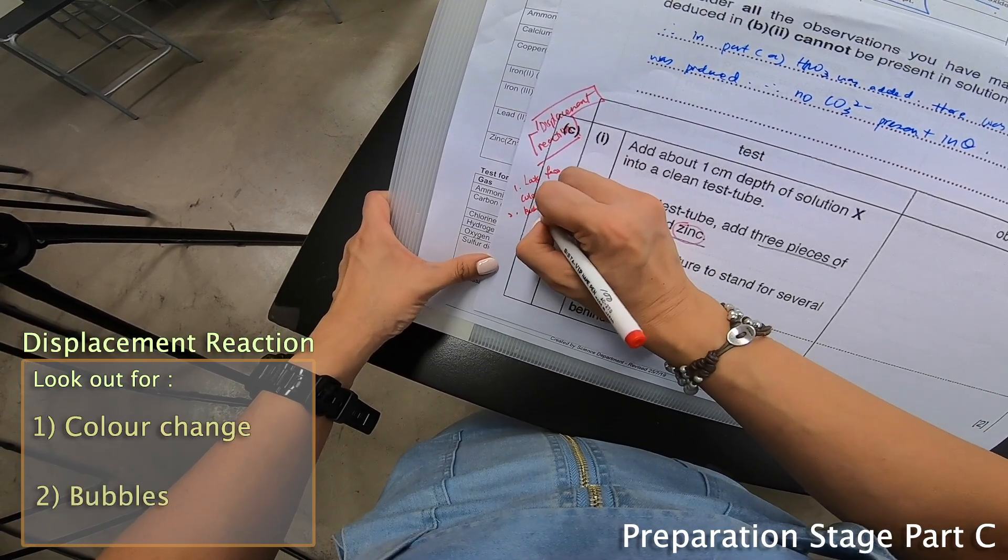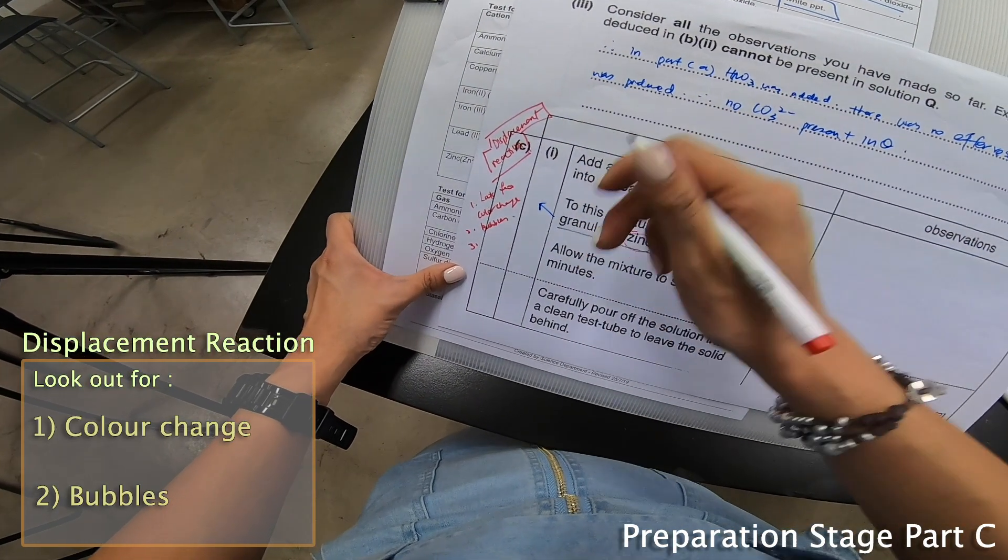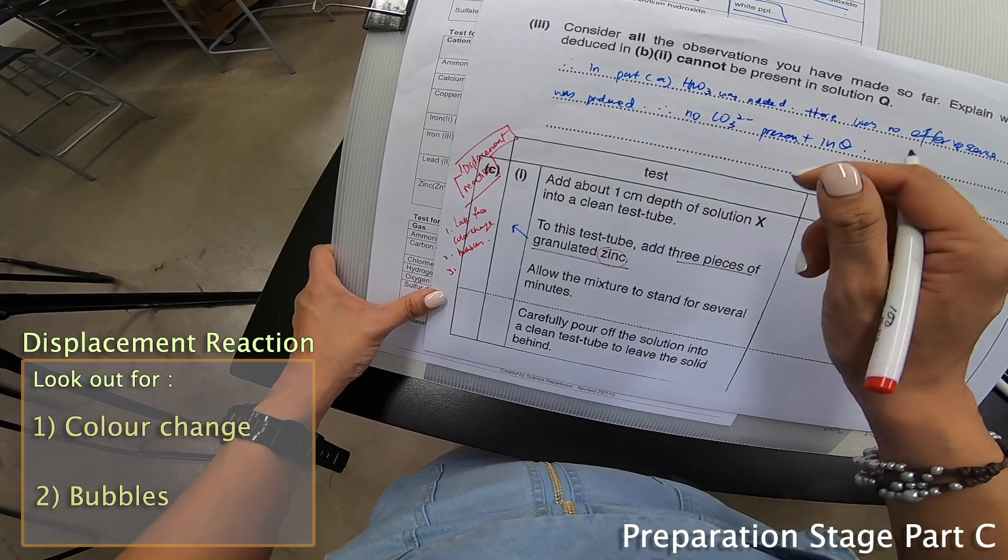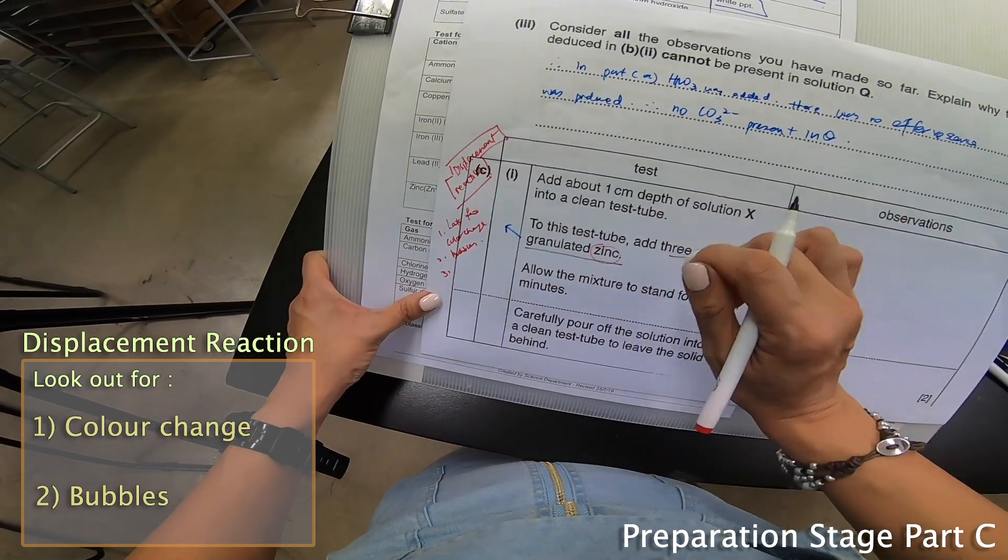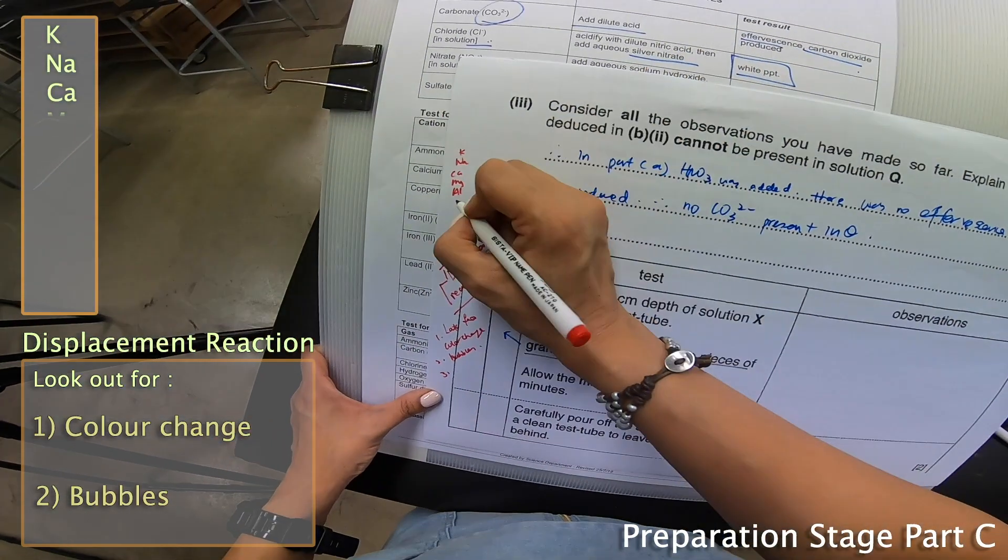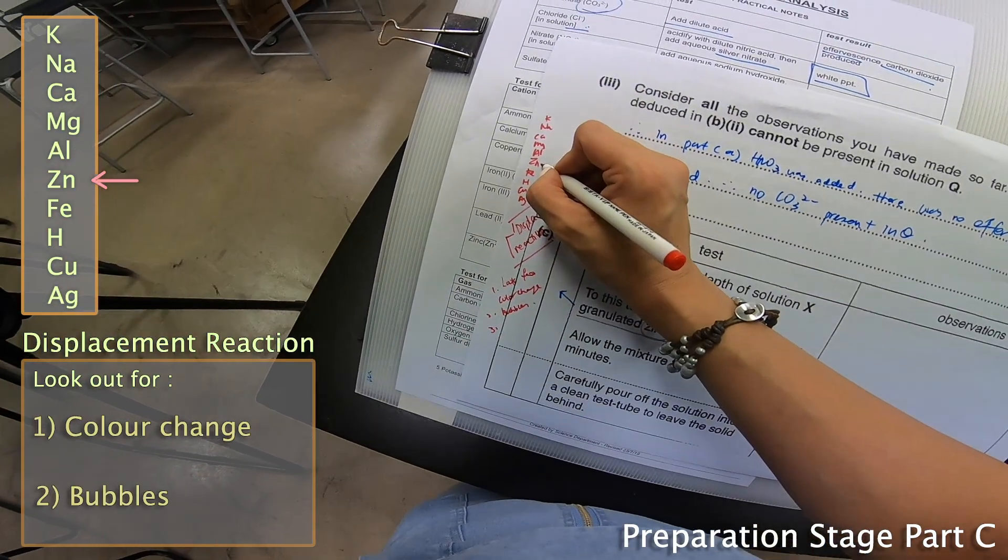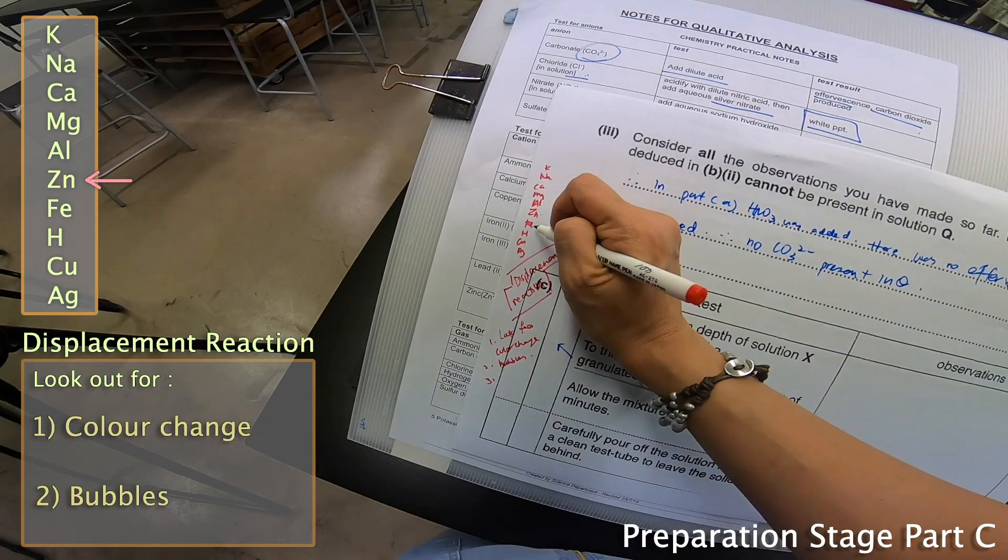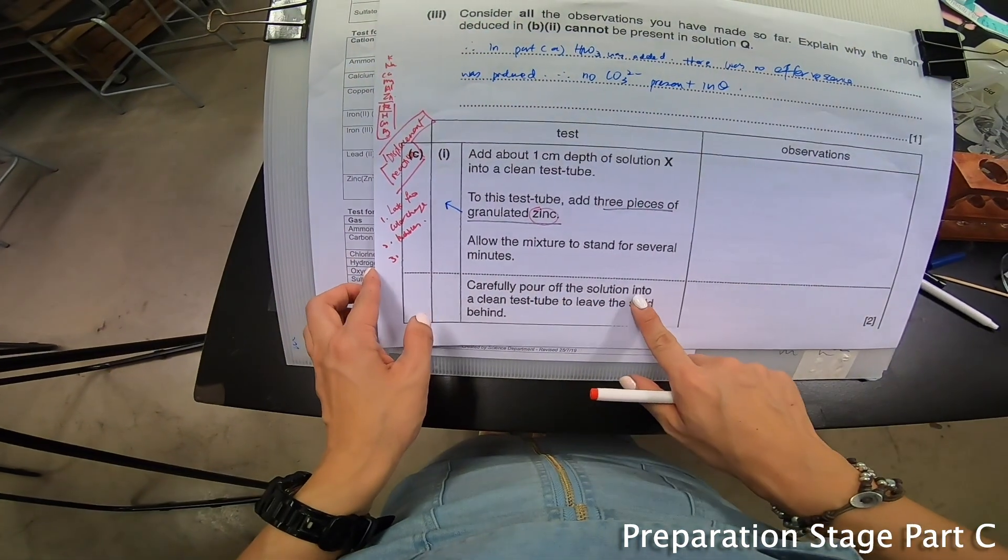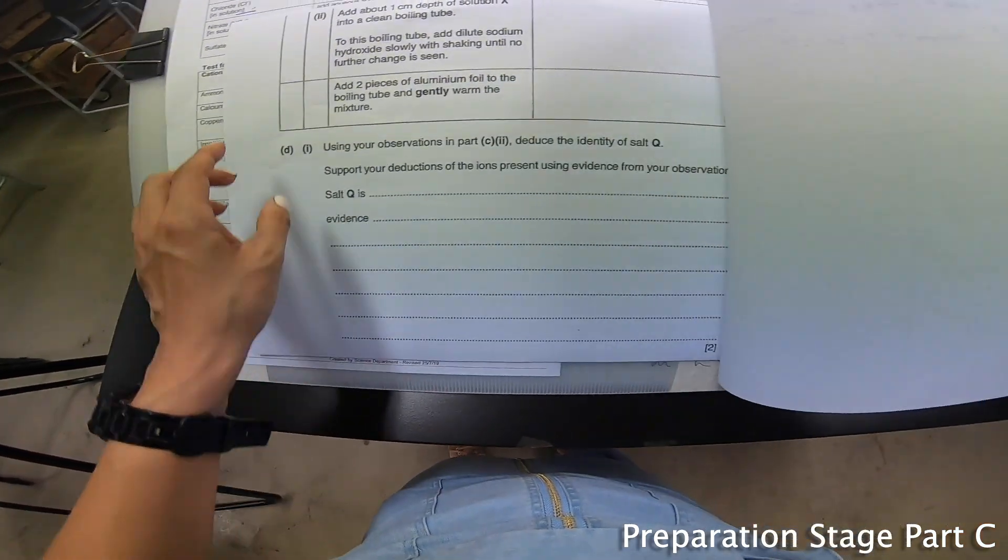According to the reactivity series of metals, you will notice that zinc is quite somewhere in the middle. So if you're guessing what's going on, this must be way below zinc in the reactivity series. Then they say carefully pour off the solution - keyword solution - into a clean test tube to leave the solid behind.